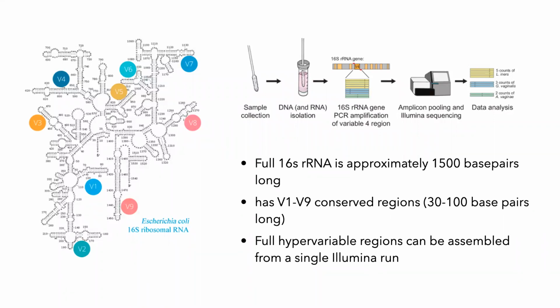The degree of conservation varies widely between these hypervariable regions, with more conserved regions correlating to higher level taxonomy, and less conserved regions to lower level, such as genus and species. While the entire 16S sequence allows for comparison of all hypervariable regions, it is 1,500 base pairs long. So who knows what is the average length of the Illumina read?